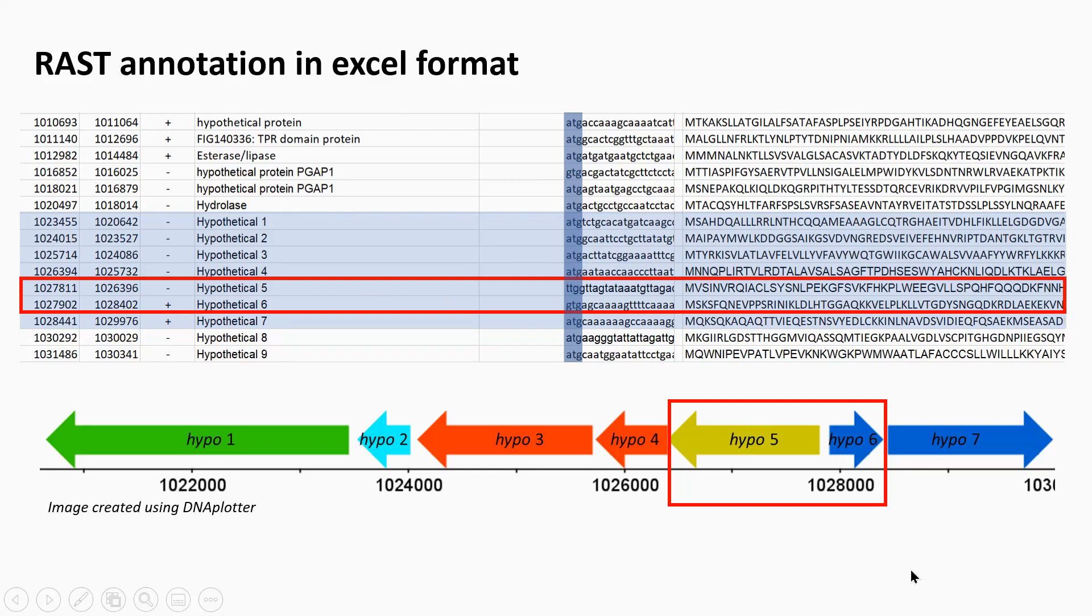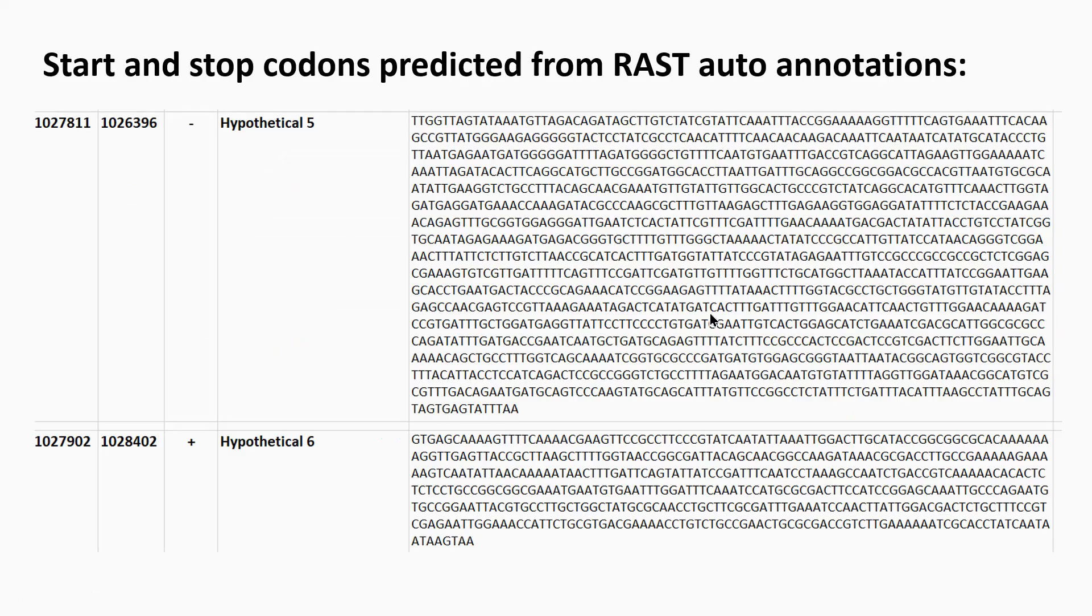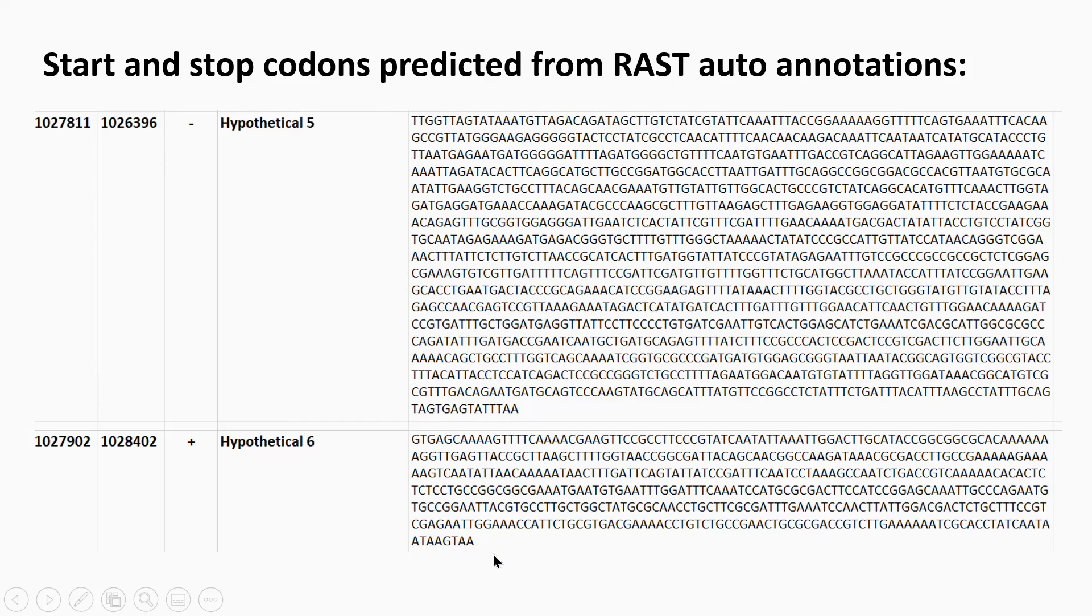Looking at the predicted gene sequence from the RAST auto annotation, hypothetical five here, hypothetical six here. You can see the TTG start codon here and TAA stop codon for hypothetical five. The GTG start codon for six and the TAA stop codon for six.